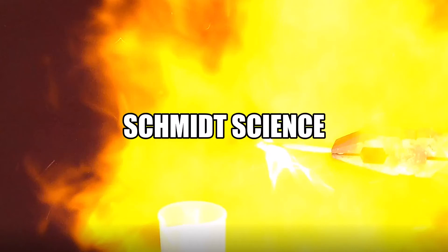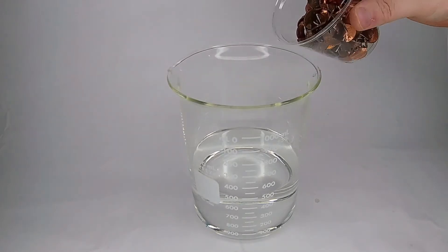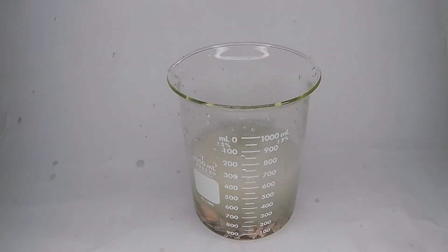For science! Previously, I made a large quantity of zinc chloride solution from dumping pennies into hydrochloric acid. What else can we do with this penny juice?